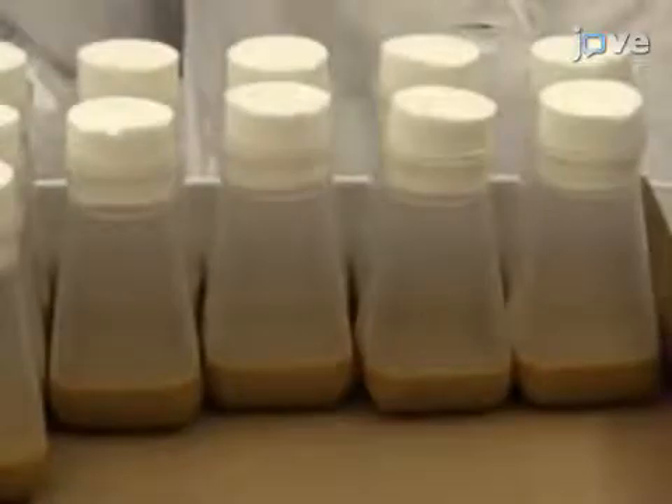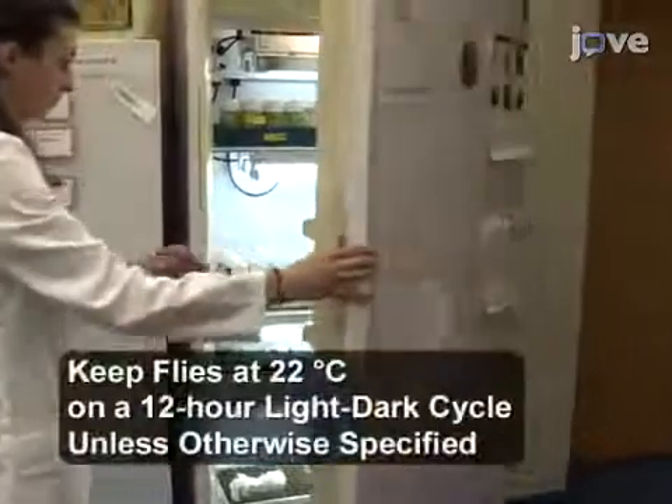To begin the experiment, maintain flies on cornmeal molasses media and store them in an incubator.